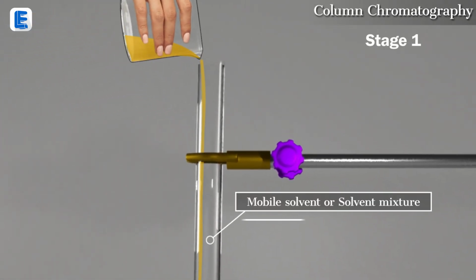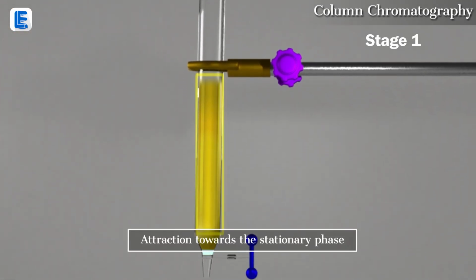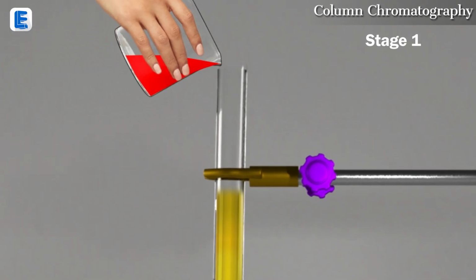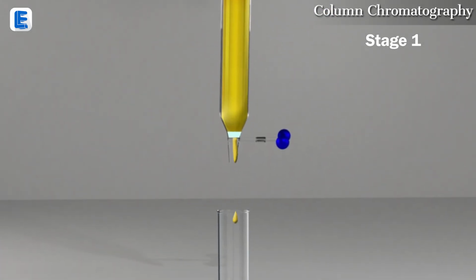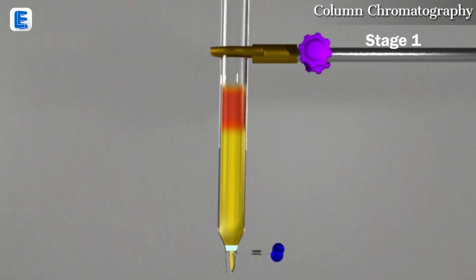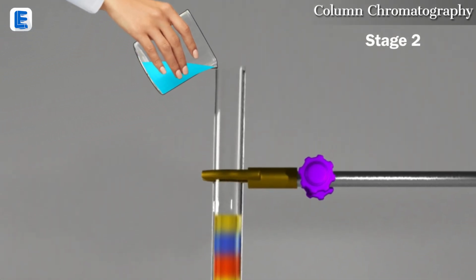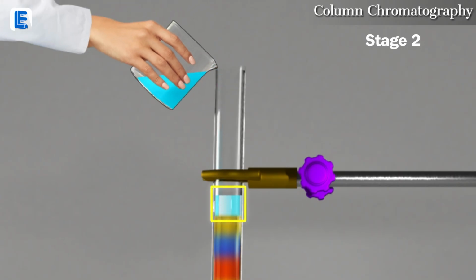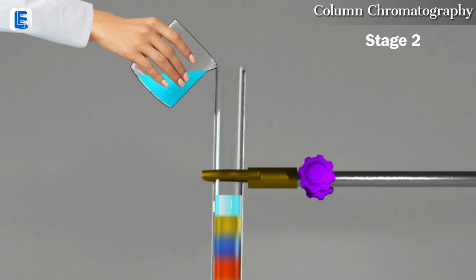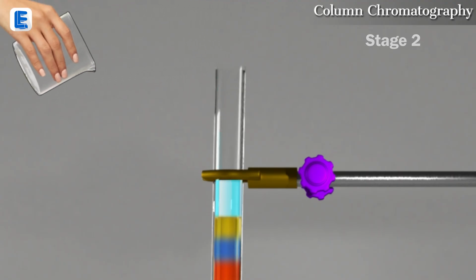Stage 1: the mobile solvent or solvent mixture should have less attraction towards the stationary phase. In this stage, the compound mixture to be separated is placed at the top of the column. By opening the tap below, it is allowed to adsorb on the surface of the silica. Stage 2: then, by carefully and slowly touching the glass column side, the solvent or suitable solvent mixture is added, so that disturbance to the upper level of the stationary phase is avoided. Solvent is repeatedly added as many times as required throughout the process.